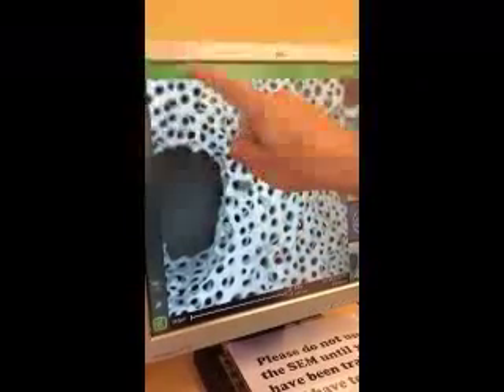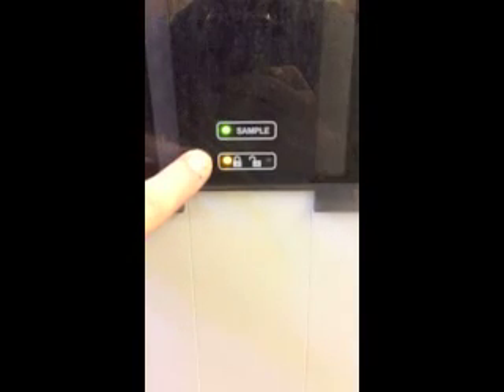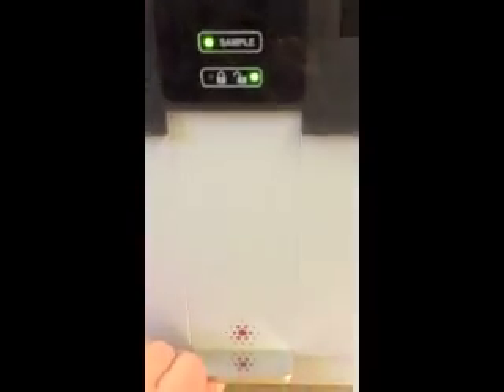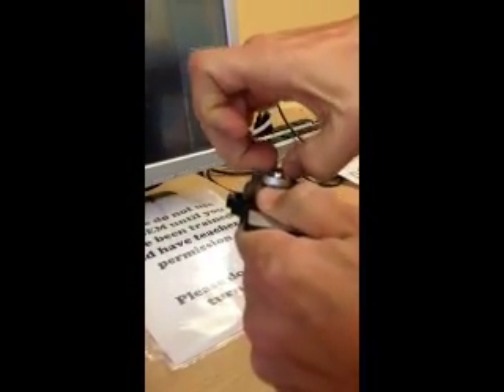And then if I'm done with that, I can go back to image. And if I'm completely done with everything that I want to do, I click this eject button up here, and then I have to confirm it. And your sample will be ejected. Wait until you see the green light on the SEM, raise the door, take your cup out very carefully. And then you can twist the cup all the way up until your sample can be taken off. Make sure not to damage your sample. Put the cup on top of the SEM, and then you can place your sample in your box. And you're done.